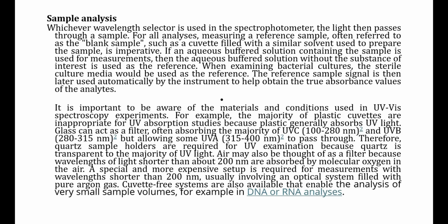So quartz sample holders are required for UV examination because quartz is transparent to the majority of UV light. So depending upon the type of spectrophotometer or the analyte that you are using, you are going to have the type of sample holder, right?